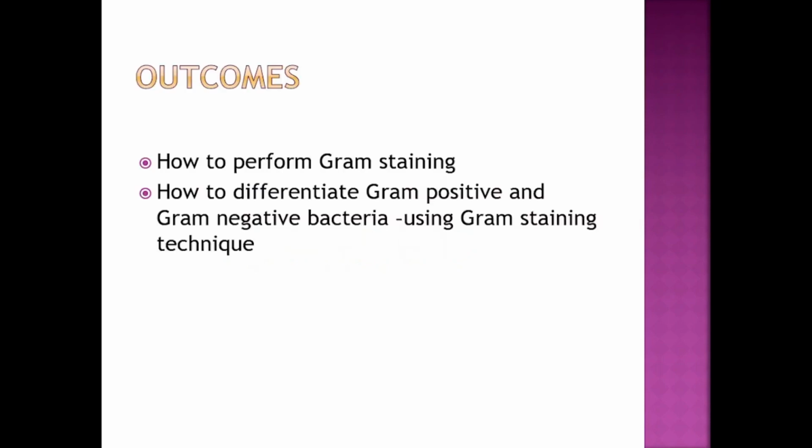Your questions are welcome. So the outcome of today's learning is how to perform gram staining. At the end of the session, you know how you can carry out the gram staining technique and how you can differentiate between gram positive and gram negative organisms using the gram staining technique, which could be utilized in the taxonomic studies of bacteria.